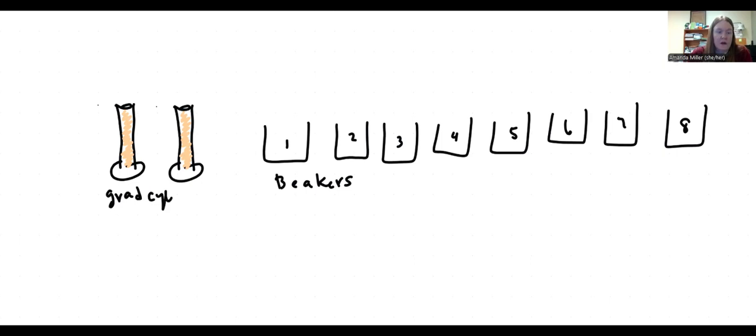The two pieces of glassware here are graduated cylinders and beakers. You can also see better renditions of what these look like in the images in the lab manual from your check-in sheet, which might be in your drawer. You can also look at the digital version.